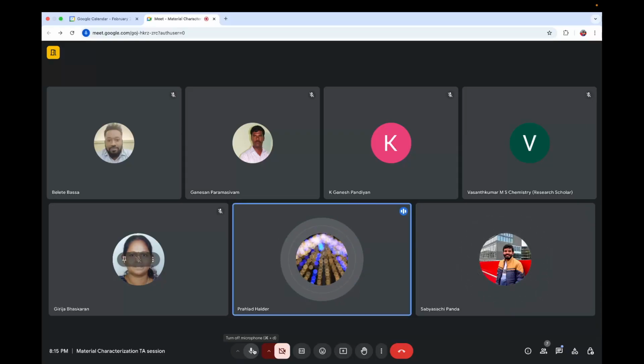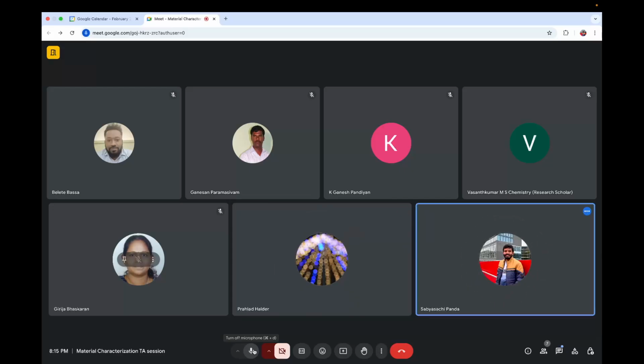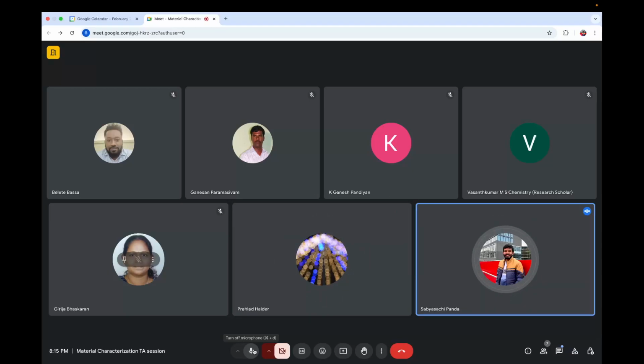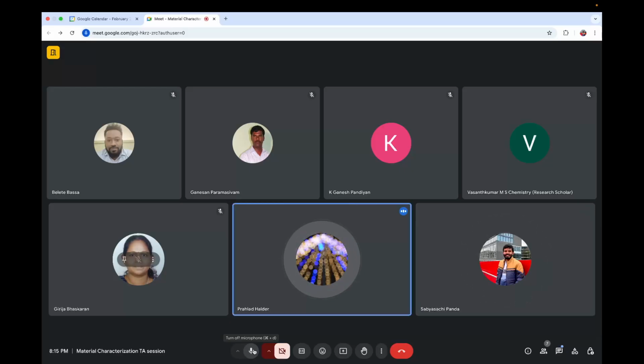I have just one query, about the useful magnification, 400 to 450 to 900. Yes, 900. This is the objective lens numerical aperture multiplied by 500 to 1000. So the limit is 500 to 1000 times the numerical aperture of the objective lens. That is the useful magnification. Is there any logic behind that range of 500 to 1000? Yes, yes.